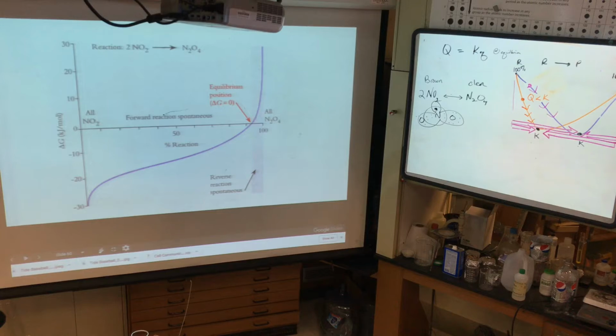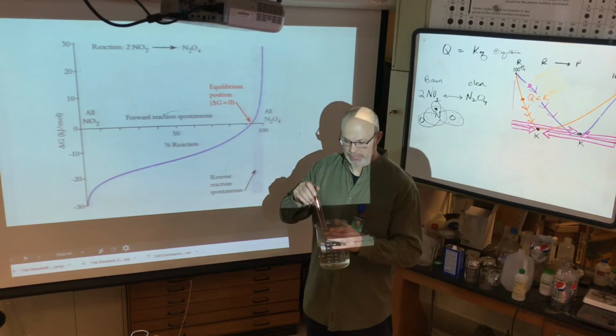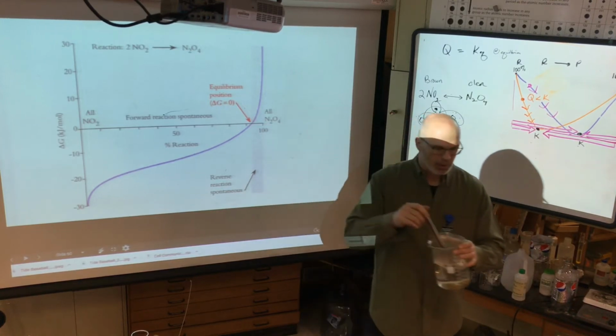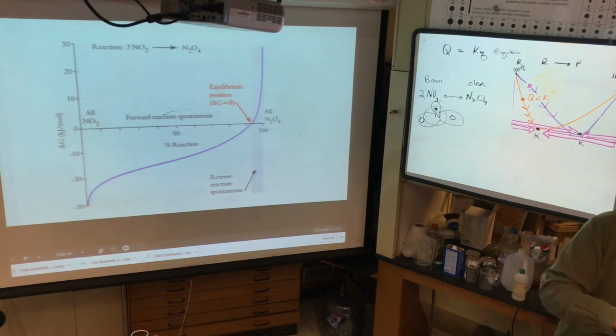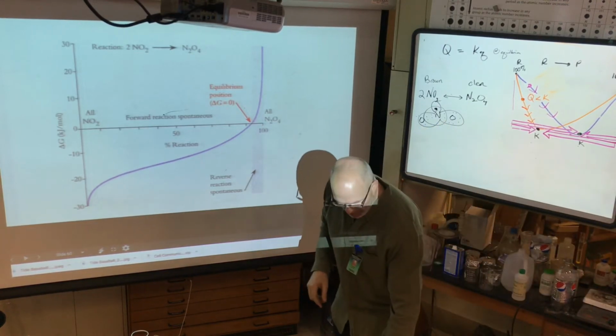Both of these tests will do what? Okay? Should be telling me the same position. I'm trying to find where the heat is. Okay? All right, now, let that sit in there. Hope it doesn't break. Now, this is equilibrium.